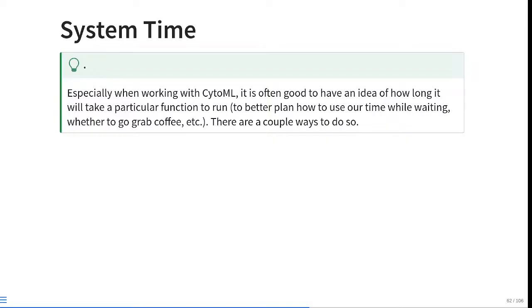However, cytoml can take a while, so it's often a good idea to know how long it's going to take to load in your particular workspace. If it's only going to take 30 seconds, you want to know that. If it's going to take 30 minutes to load in all your FCS files, that gives you time to go make coffee, come back, and still wait a few minutes before it actually loads in.